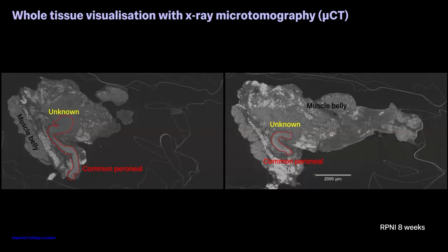The staining is not selective, and apart from being able to see that there is something there where the tissue is less organized, there's not much information on how new axons are forming, how they are branching, and whether or not electrical stimulation or the general health of these axon branches is suitable for the purposes of a future bioelectronic interface.